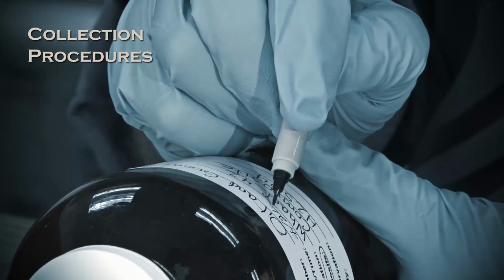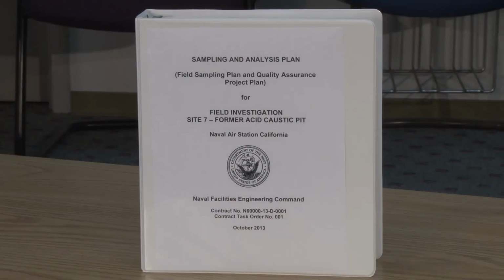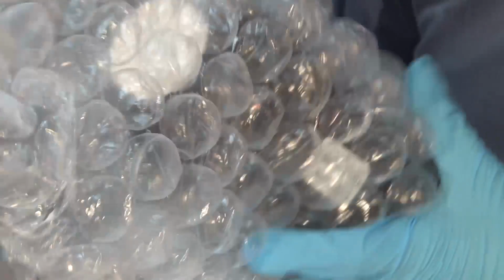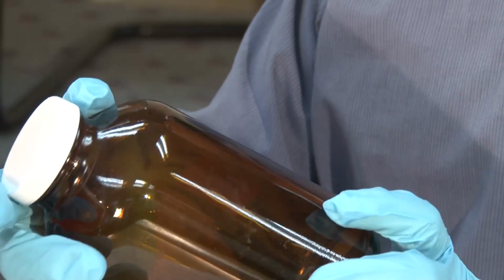Let's move on to the procedures for proper stormwater sample collection. Prior to collection, review the SAP, which deals with the sampling procedures. Check the sample container kits to ensure that all necessary equipment has been provided, is clean, and is intact. That is, there are no cracks, broken glass, etc.